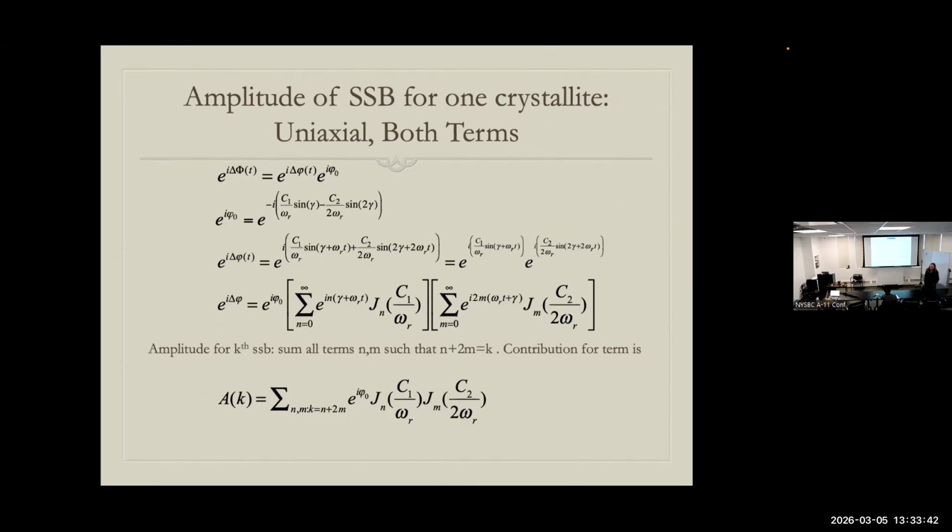And I would say she had particular deep insights where math met the solid-state NMR, that's for sure. So we take on this approach to analyzing the spinning side bands, and it appears in many of the simulation routines. It's not the only way. Like you said, why don't we try a Taylor series, and that might be a better move now that fast spinning has gone in place. Maybe it's important to look back at it. There are other ways people have thought about this, but this was a real breakthrough to take this mathematics, and so that's the one I like to teach.